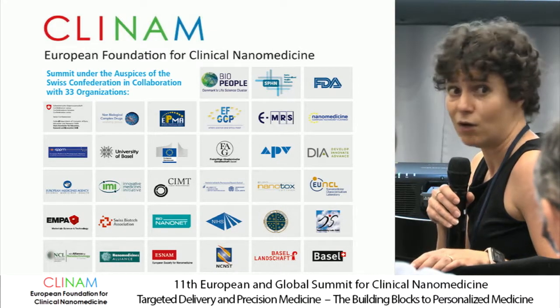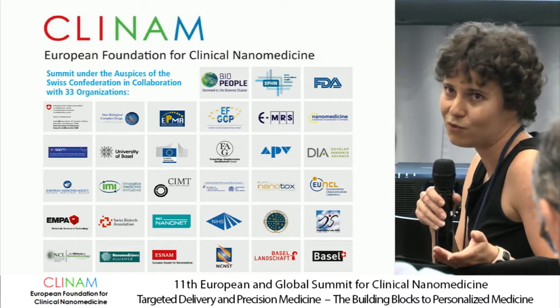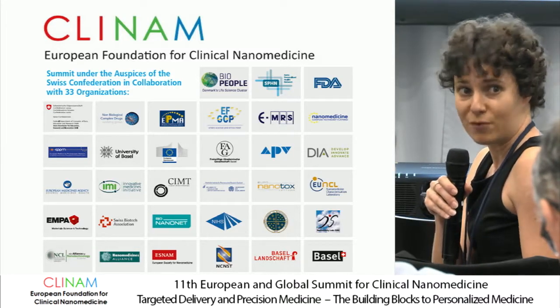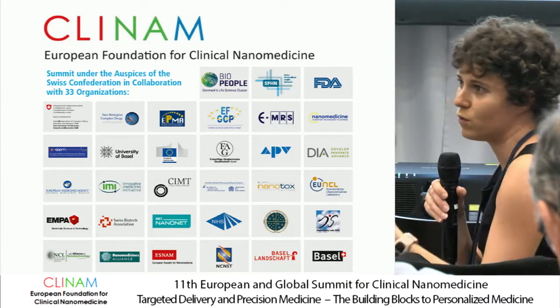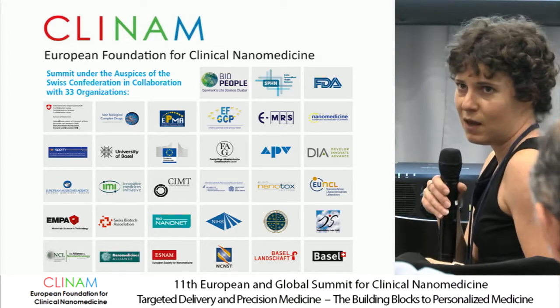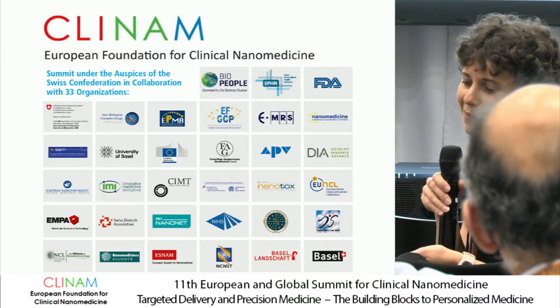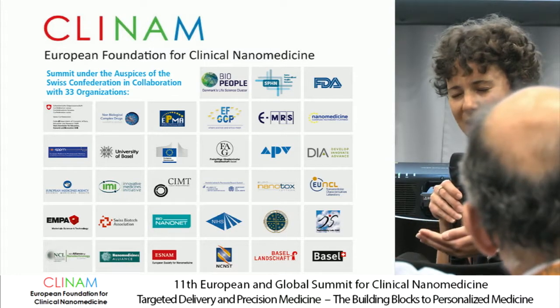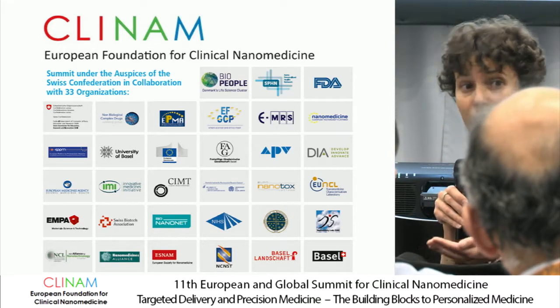Honestly, I think there is the risk of using instruments that are easy to use without proper training. There is also the risk of tracing. We talked before about tracing the data, and also the conditions that were used to measure. We need to check if the measurements are done properly or not.